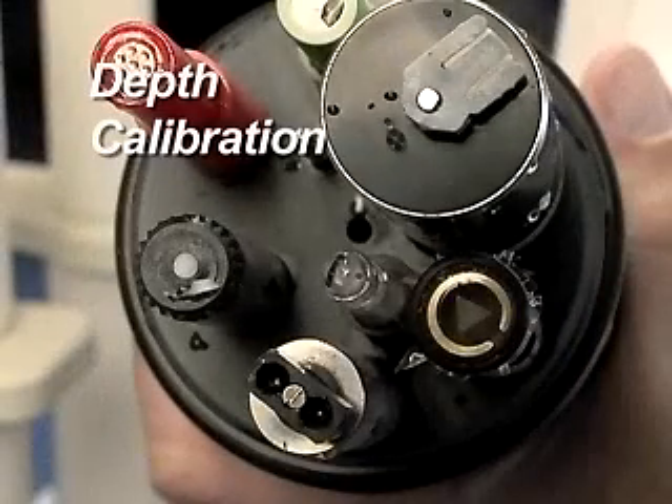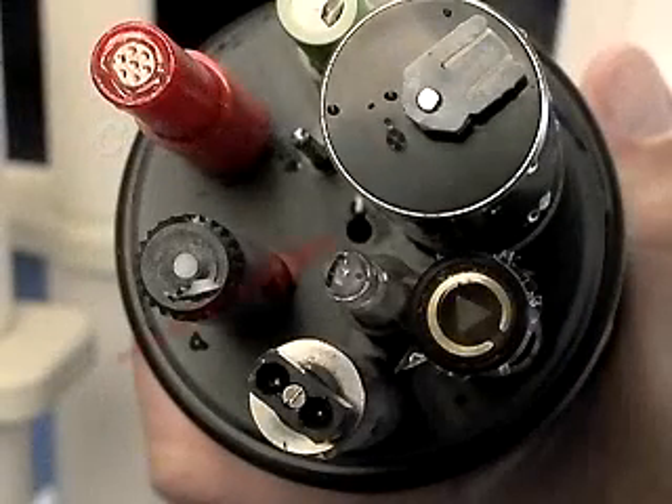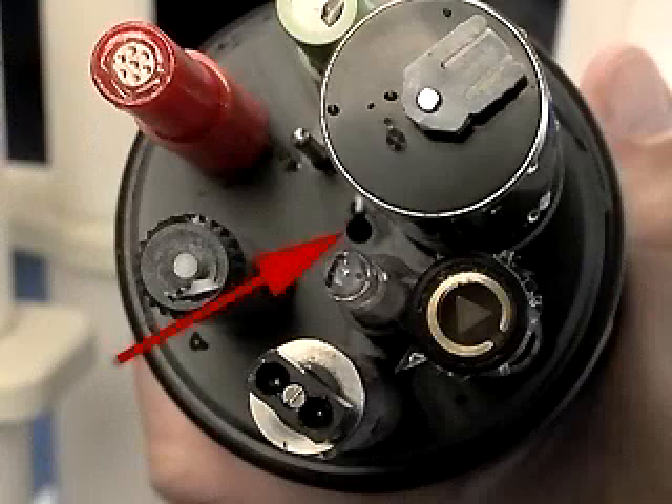Depth calibration. Function. The depth sensor is a very sensitive pressure transducer. The software in the sonde converts the pressure reading into a depth value with compensation for temperature and salinity.